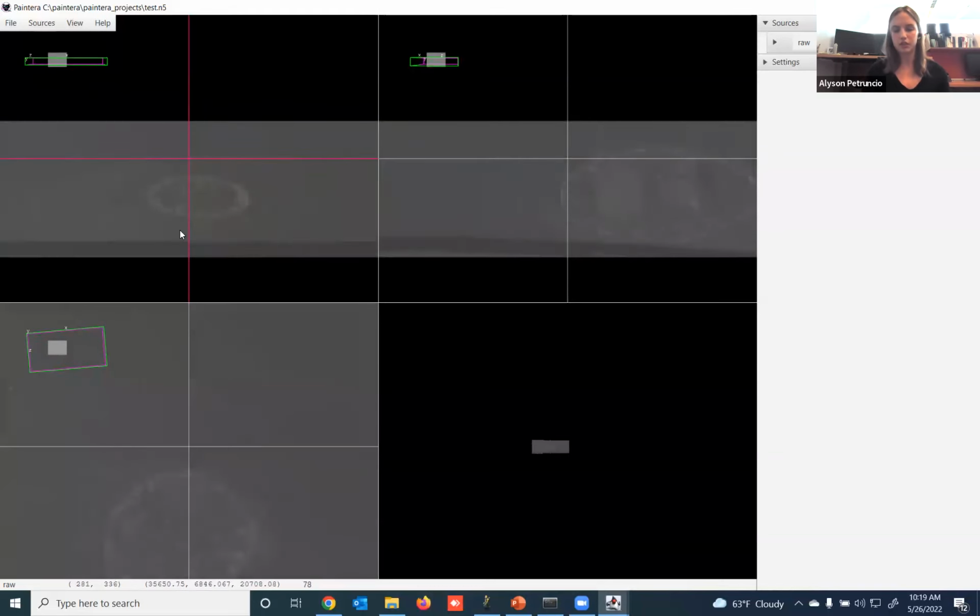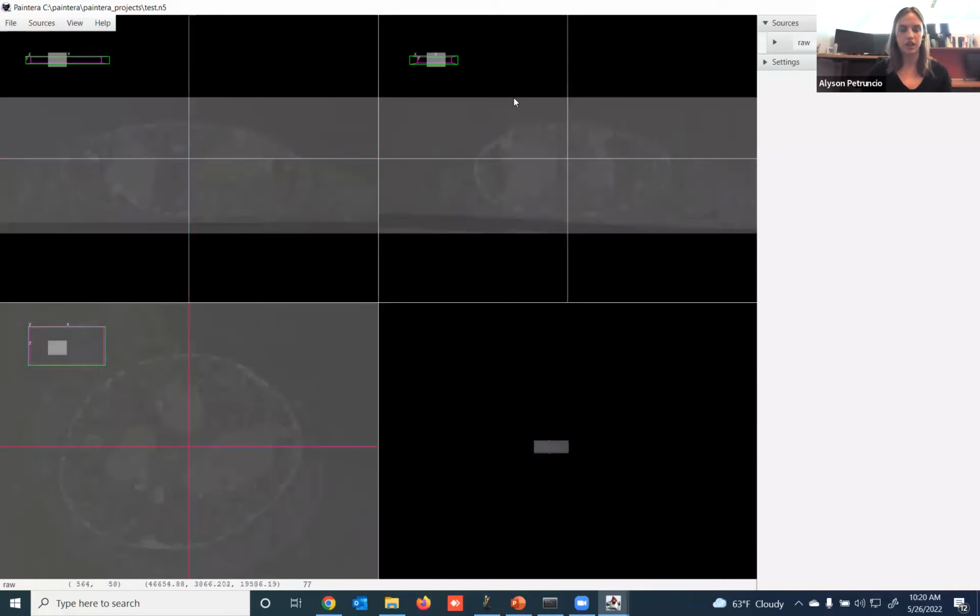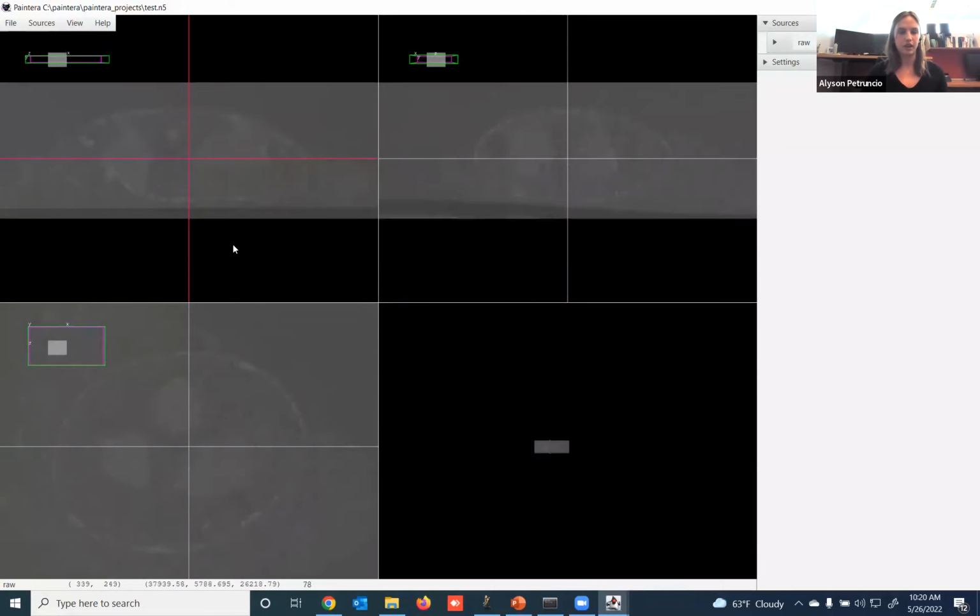And you can also use the keyboard to scroll directly through a plane. You can use the period and comma keys to slowly scroll. If you're using your mouse, you can use the wheel. And then if you hold down Shift with either of those functions, then you can scroll faster. And it's a great feature to have these 3 orthogonal planes in view, because this will come in very handy during shape interpolation of labels.